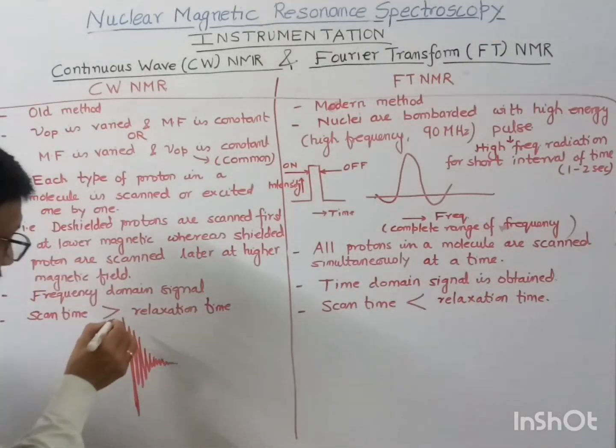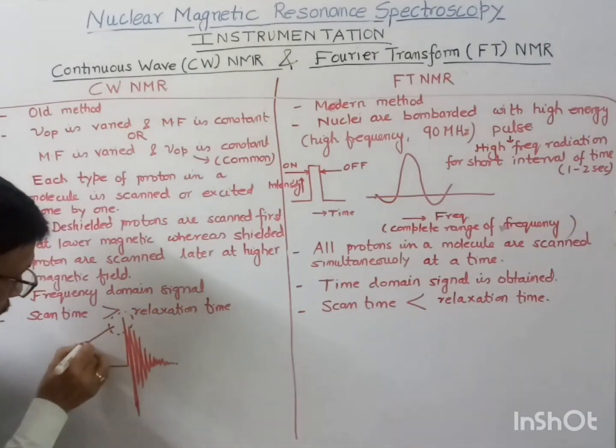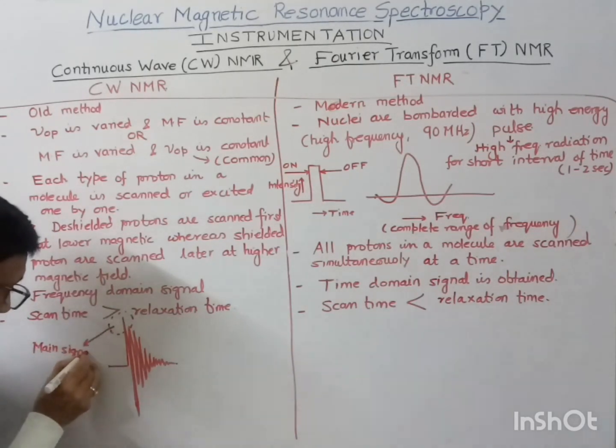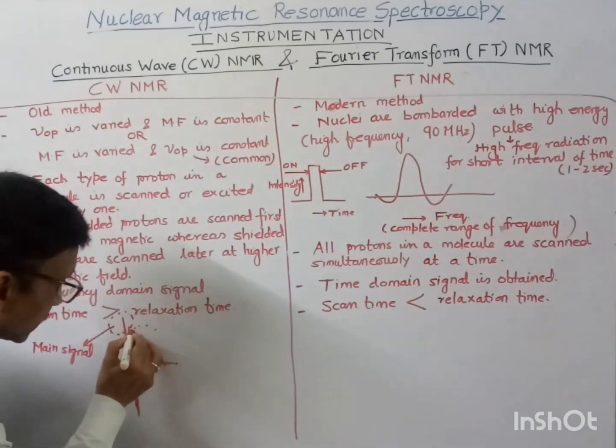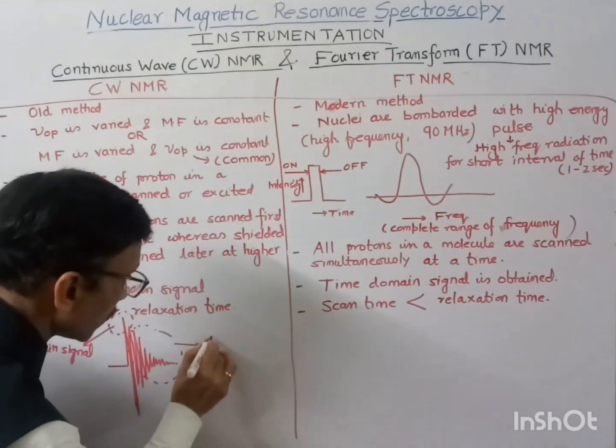So if you see, this is our main signal, whereas this part is called the noise.